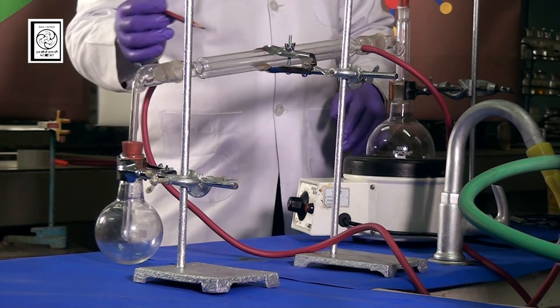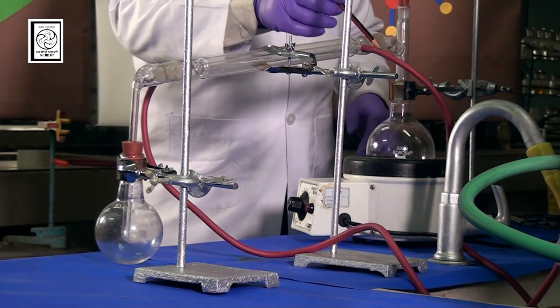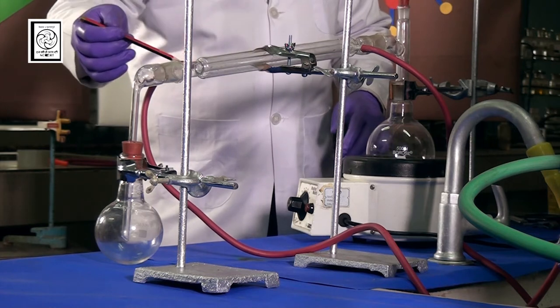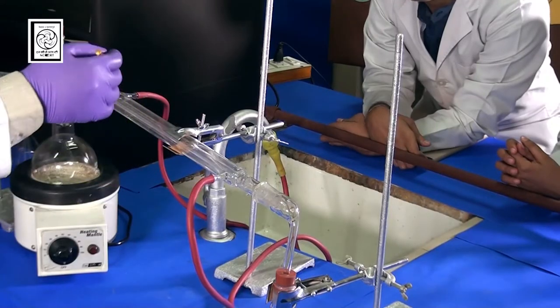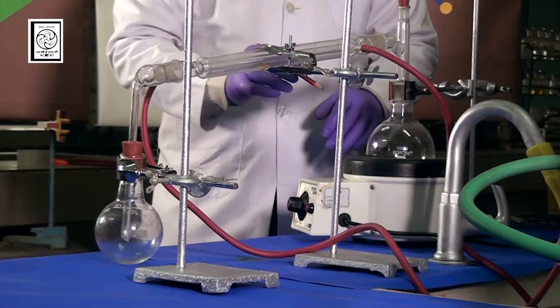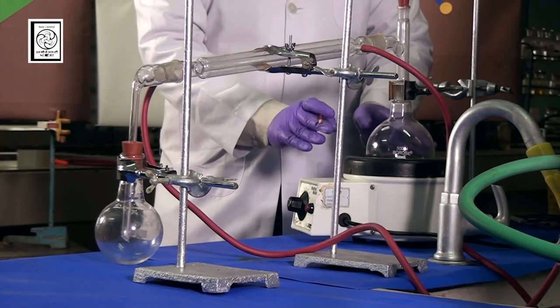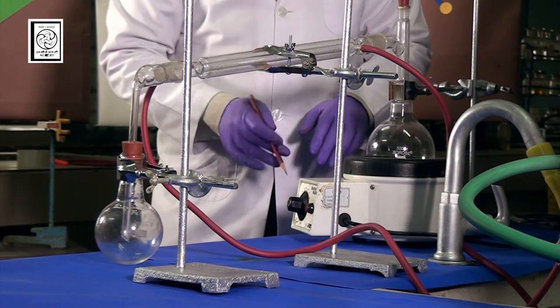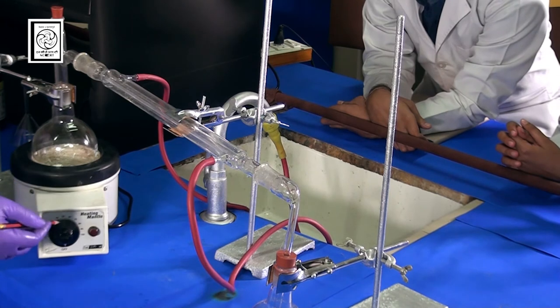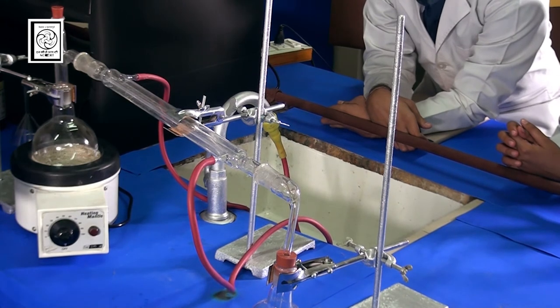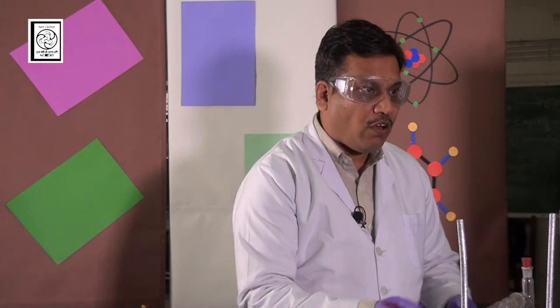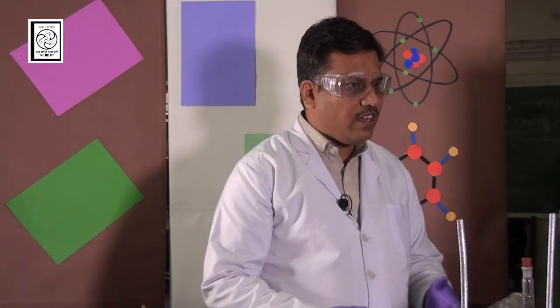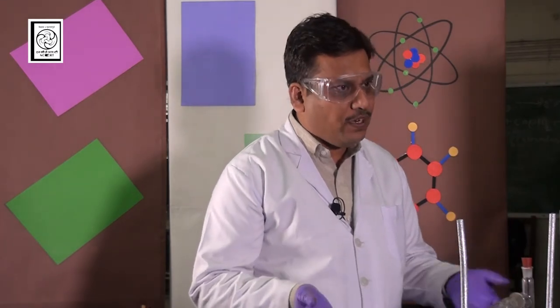In this condenser you are observing two outlets. Rubber tubings are there. This is for inlet water supply and this is for outlet. For the heating purpose we need a heating device. Here we are using an electrical heating device and the device we can use in a controlled manner. The temperature required for distillation purpose we can control by using this. So let us start the process of simple distillation.